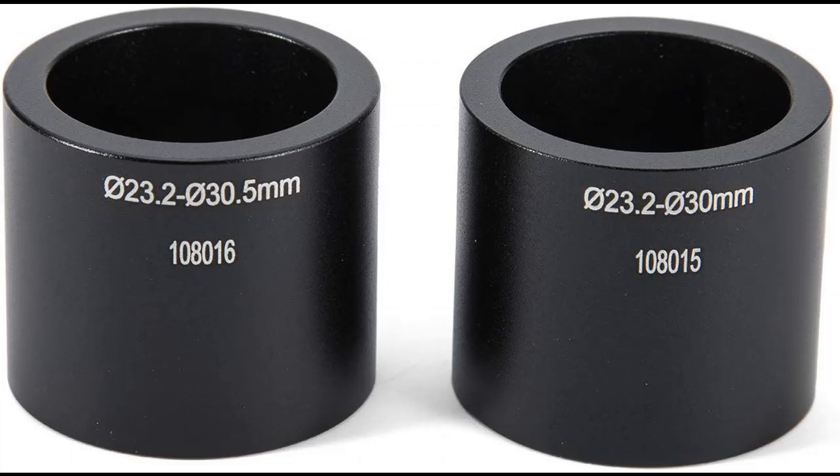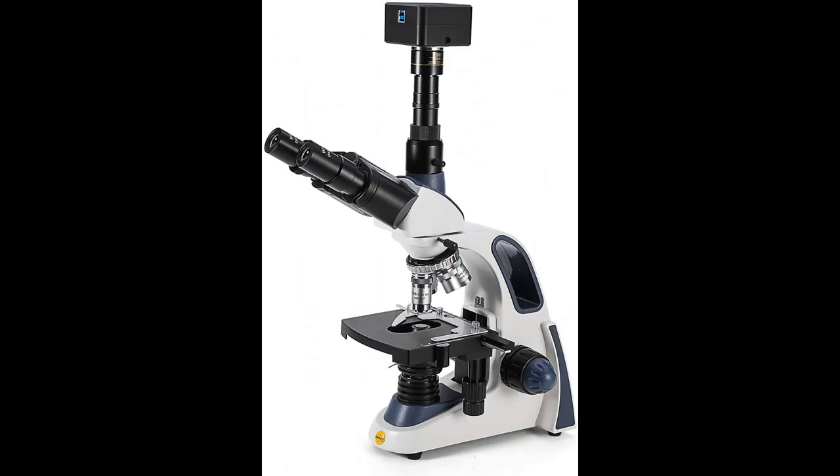Connect the camera via USB to your computer to capture pictures and video. The reduction lens keeps the camera image true to the size and clarity that is viewable through the microscope alone.